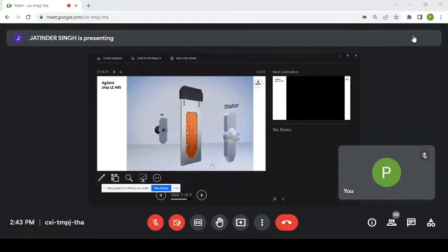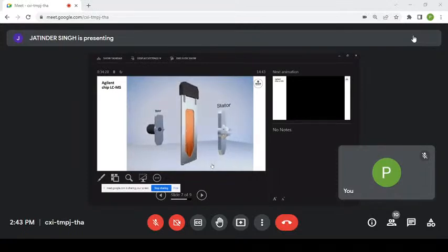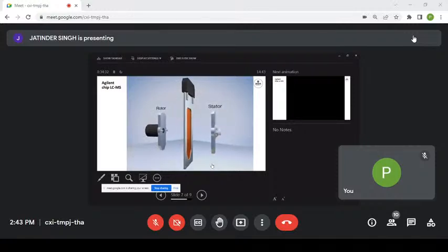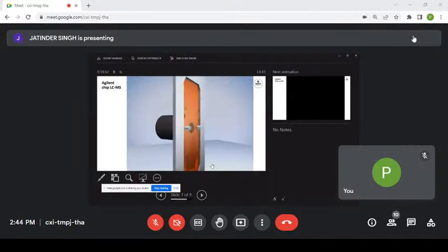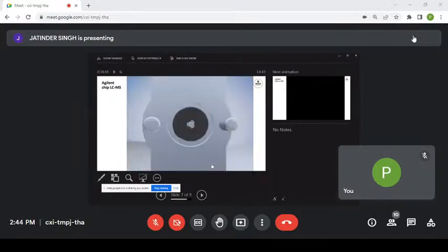There we've got the rotor and the stator. I was just too impatient. So very much like the valve you've seen this morning, but then they've got little connection points onto the chip. And then they allow to nicely align. So that happens inside the instrument once you put it in. And then it allows you to have different fluidic pathways.